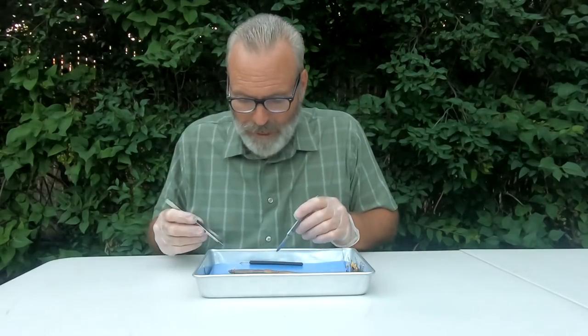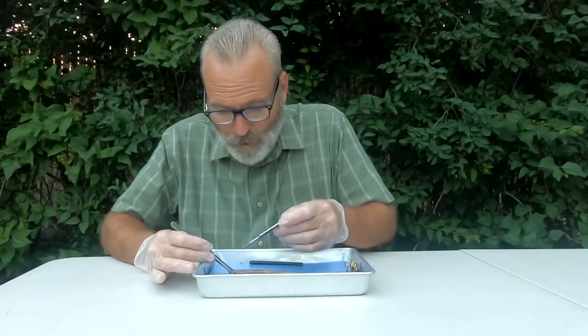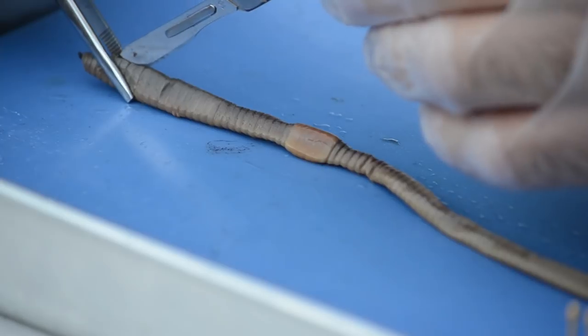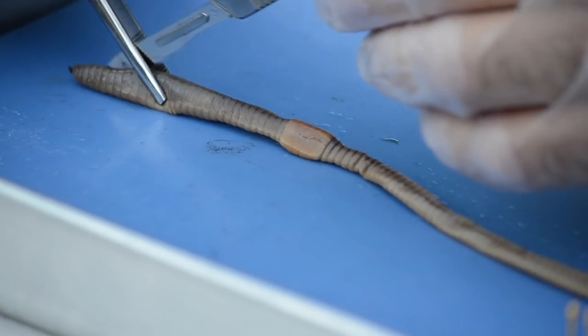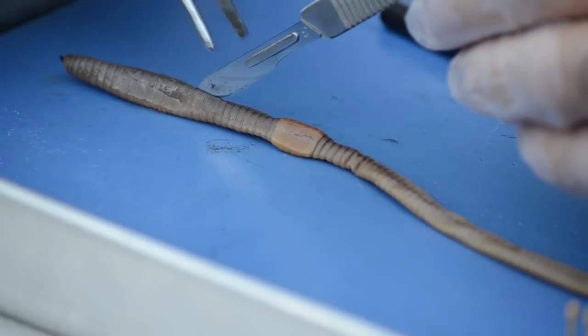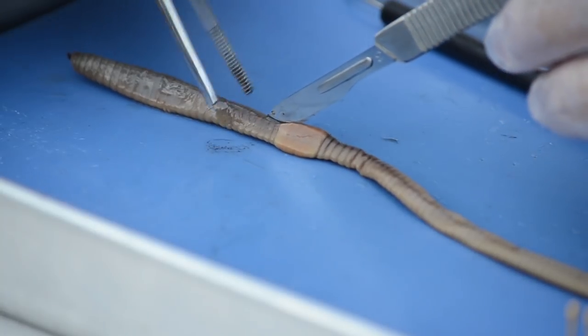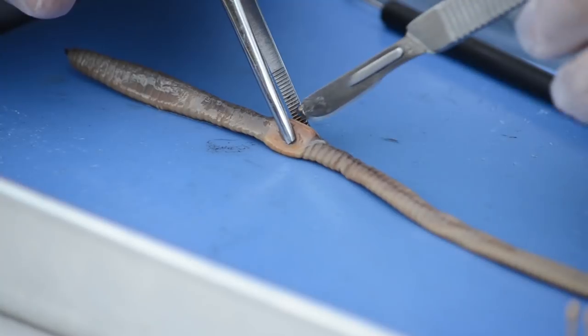Let's go ahead and get inside here now. Let's start making an incision right here by the prostomium, dorsally. Just lightly make the incision. You can see a little bit of preservative that might be oozing out of the specimen. All it is is preservative that's used to keep the organism from decomposing and being fresh for you.